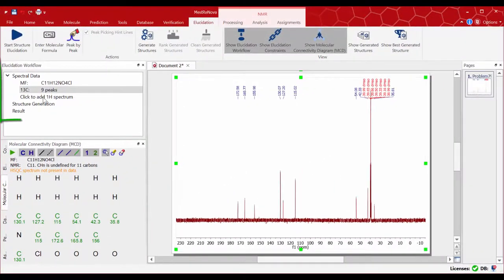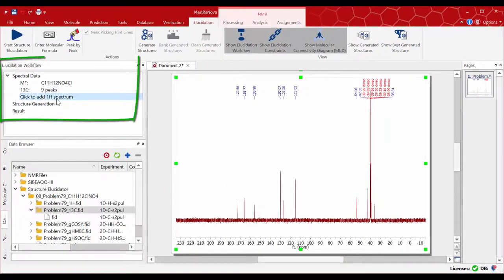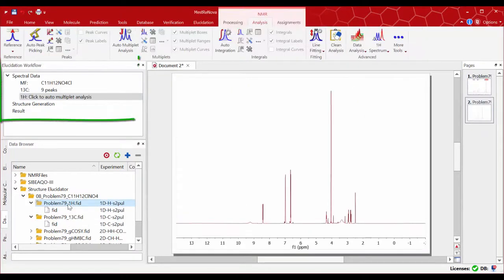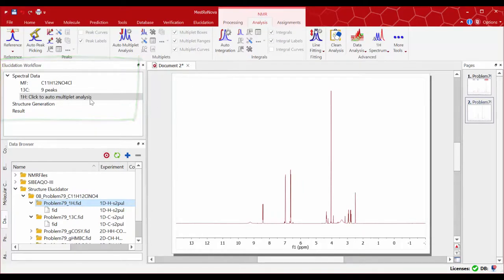Now you can add the proton spectrum. Drag and drop your data set and follow the instructions given on the elucidation workflow panel, then carry out auto-multiplet analysis.